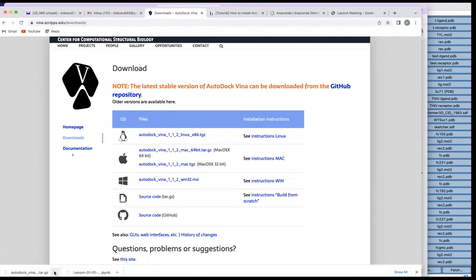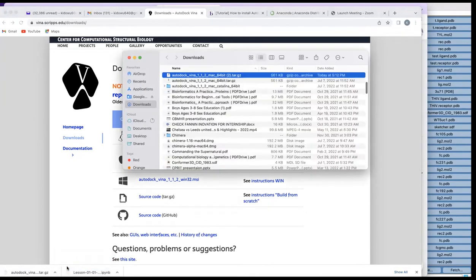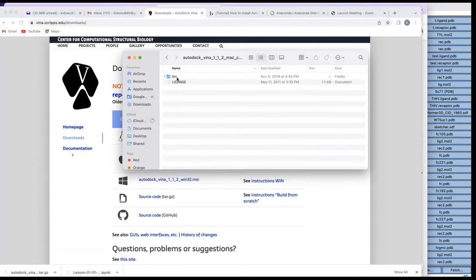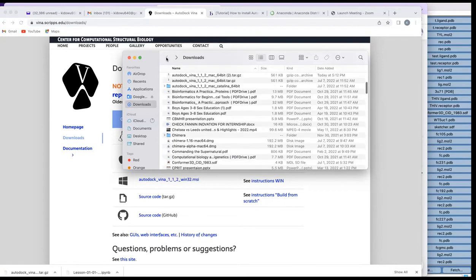Once you download it, it saves directly into your Downloads folder. Open it in folder and double-click on it. When you double-click on it, it will give you a folder — this is a tar.gz file but when you double-click it, it generates a normal folder named something like 'autodock_vina_1_1_2_mac_catalina_64bit.' Open this folder and inside you will see a 'bin' folder and a 'license' file.